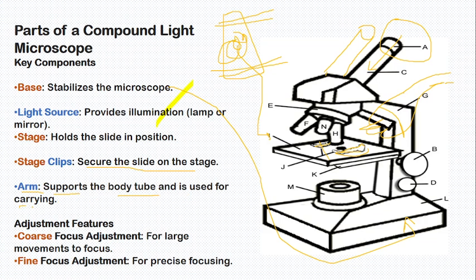The arm holds the body tube. The body tube is this one, held by this arm.